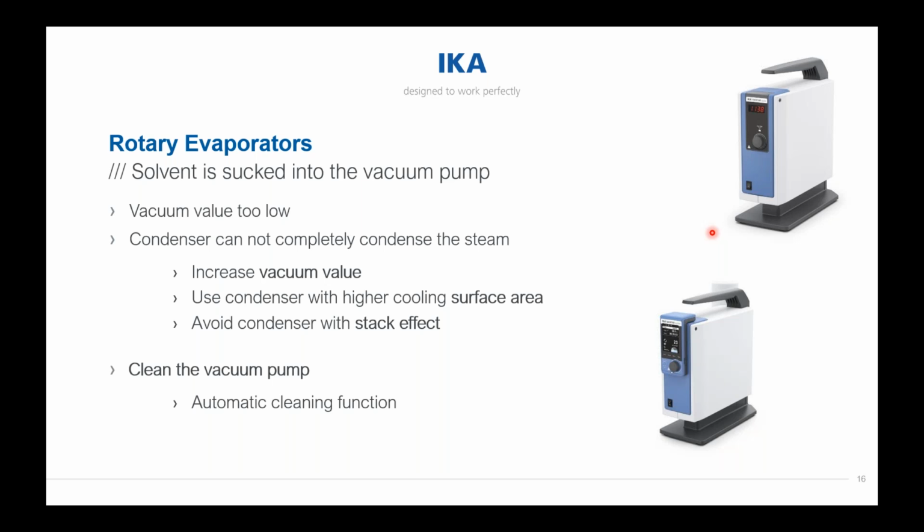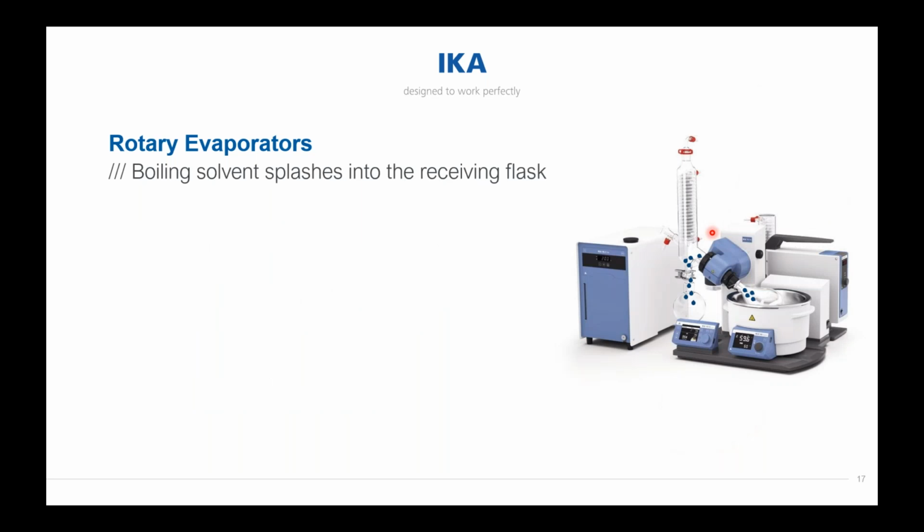That's also how I build up the whole presentation. I just want to focus a bit on some problems which you may be facing in your daily life and how we can solve them. So the next problem you may know is if boiling solvent splashes into the receiving flask. Here is a picture so that you have an idea what I mean.